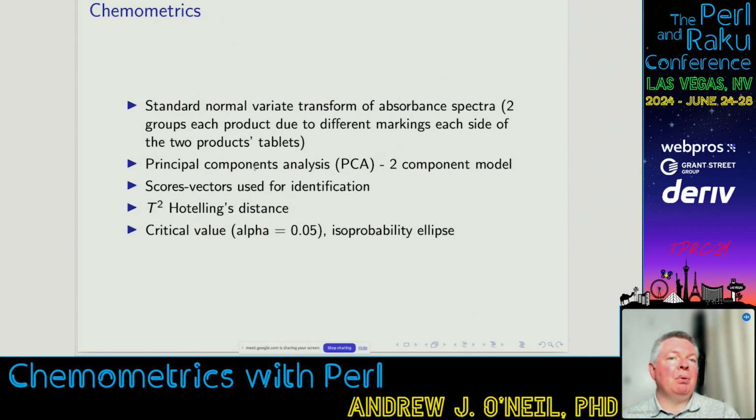itself, which is based on principal components analysis. And here I've just used a very simple two principal component model. So this is the multivariate mapping of the spectrum from the original high dimensional space of 228 wavelengths down into a pattern space of just two variables, which is something you can plot essentially on a graph. I must stress, though, it's not necessary when the device is actually running to ever plot anything.